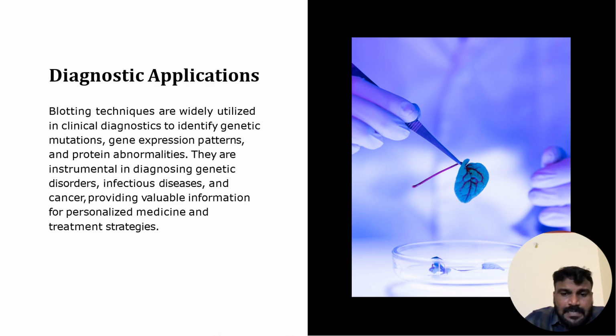So coming to the application aspect, these blotting techniques are widely used in clinical diagnostics to identify genetic diseases, genetic mutations, and gene expression patterns between tissues and between different patients, and even find protein abnormalities. These techniques are very important in diagnosing genetic disorders, sometimes infectious diseases, and cancer. So altogether, these techniques provide valuable information for personalized medicine and to strategize the treatments.